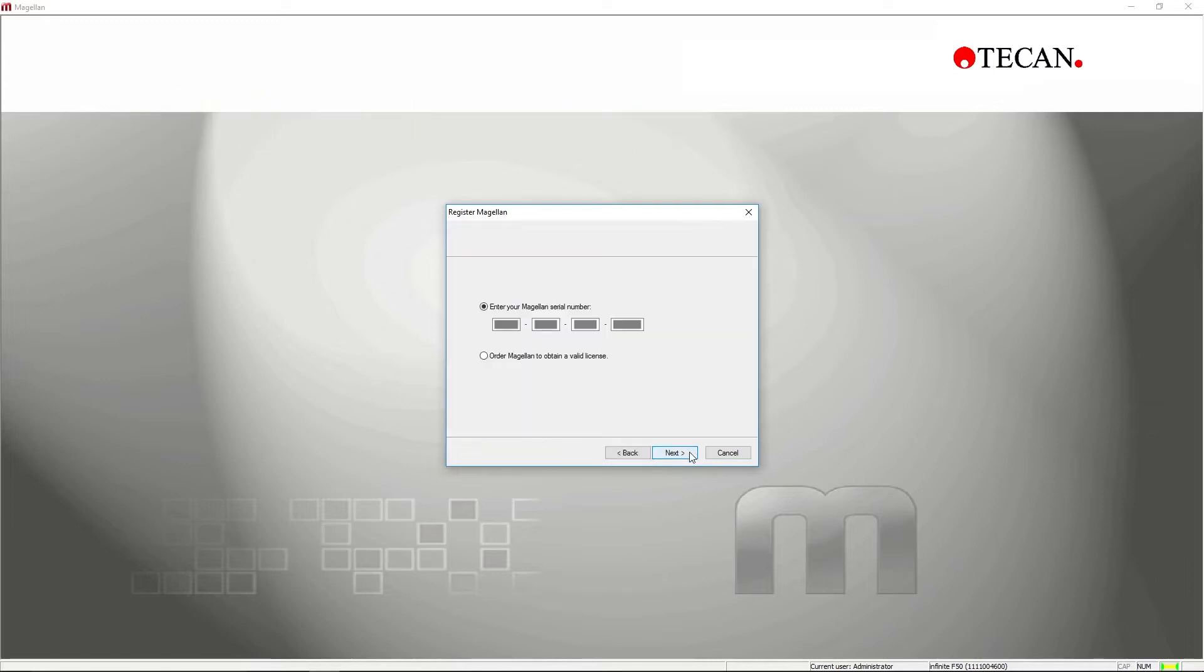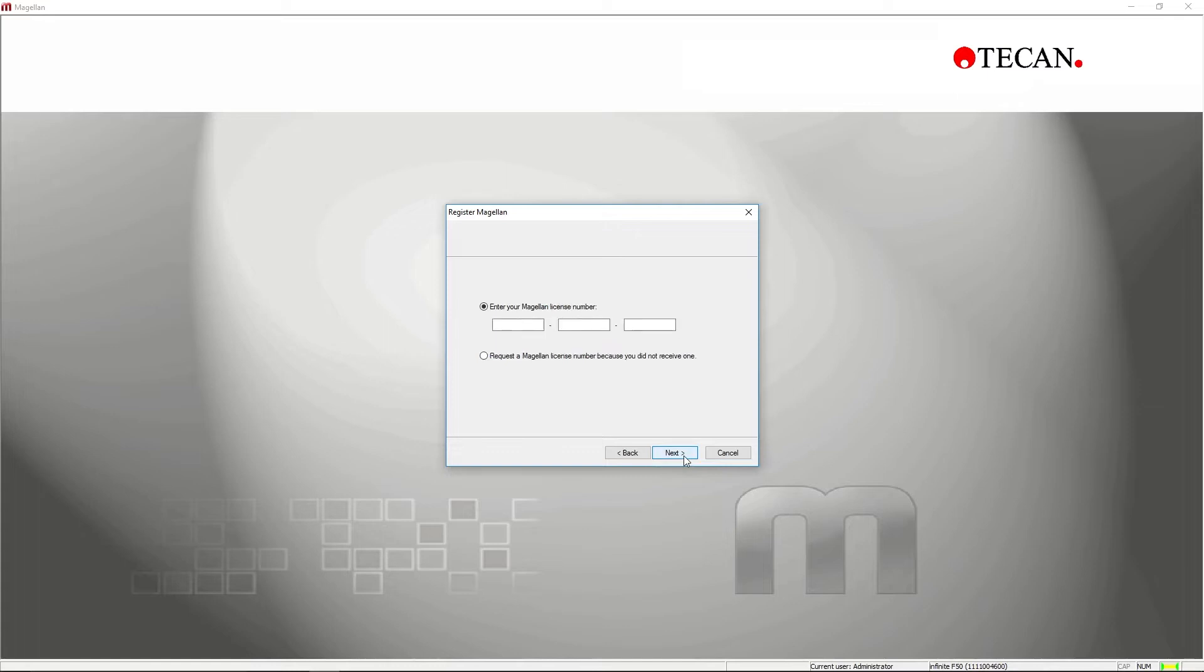Follow the instructions of the registration wizard and, when prompted, enter the serial number, which can be found on the plastic pouch of the USB stick. If you are a new user and do not have a license number yet, select the option to request one.